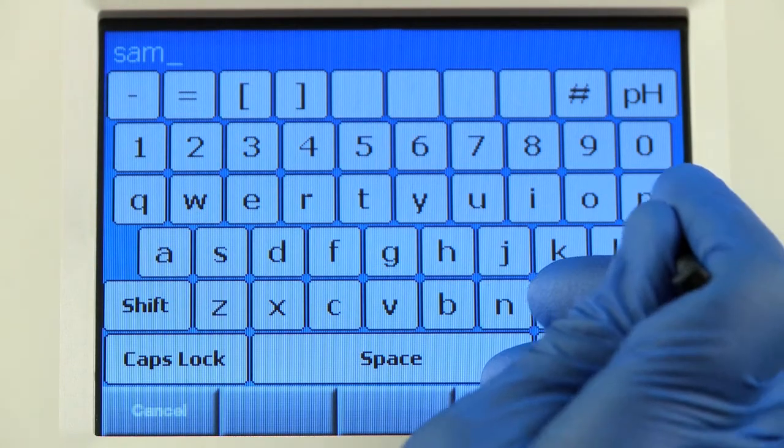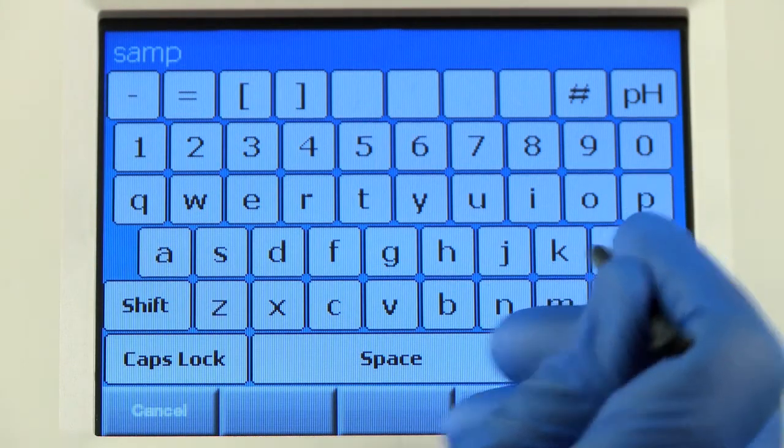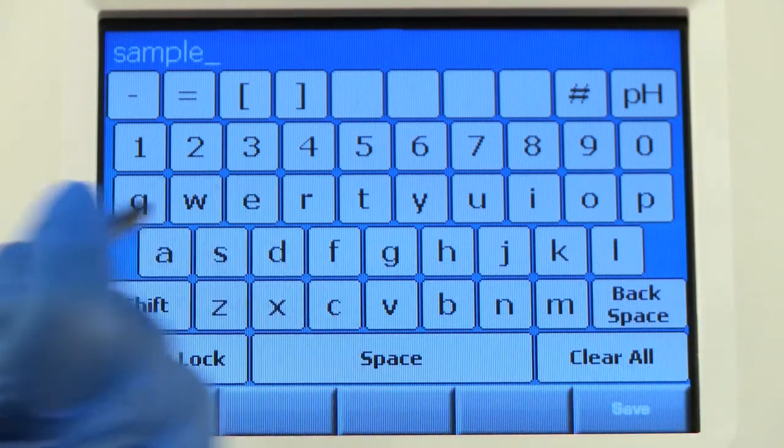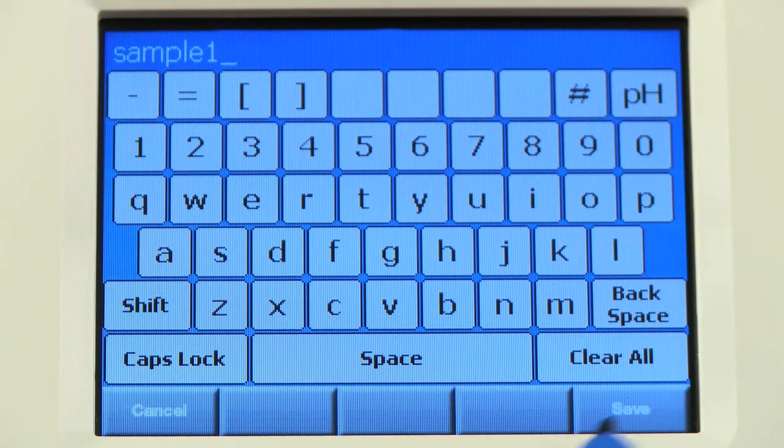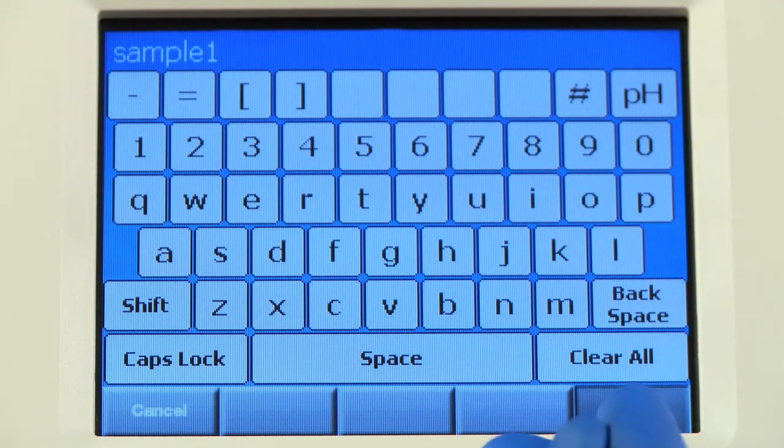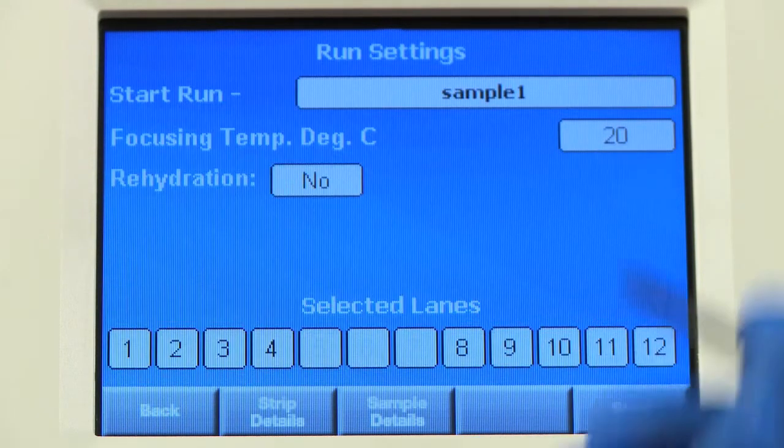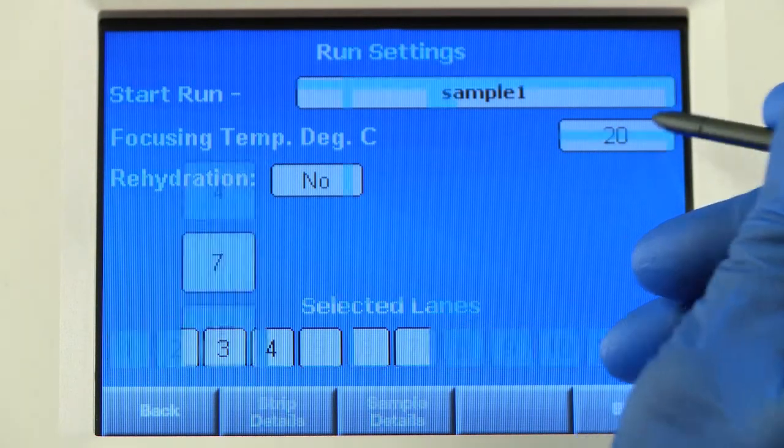Here, you can give the run a name and set the Focusing Temperature.